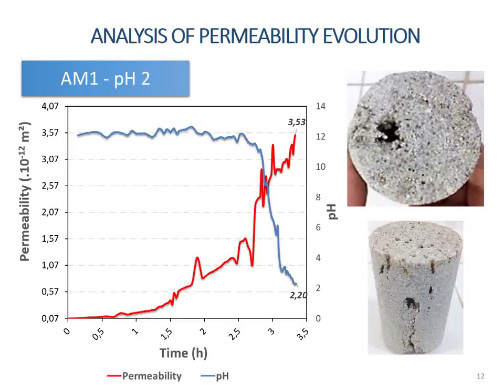Analyzing the graphs, it is noticed that the pH of the percolated solution is reduced exactly at the point where there is a greater increase of permeability, going at that moment from a pH value of 11.5 to 2.2. In this case, possibly the system has been found to be in equilibrium, and the flow passage of the acid solution is being performed only through the formed wormhole.